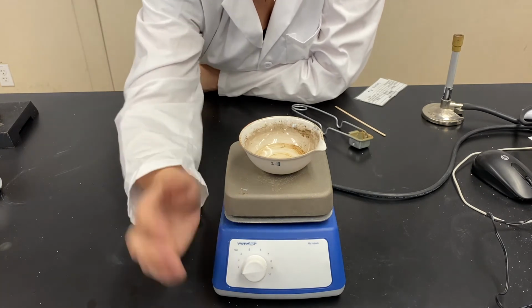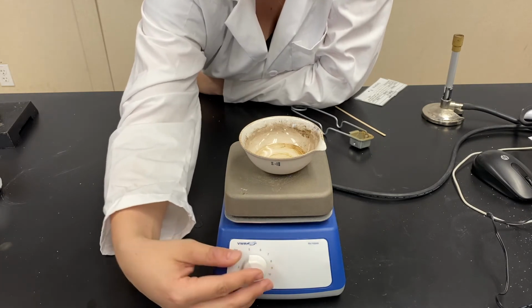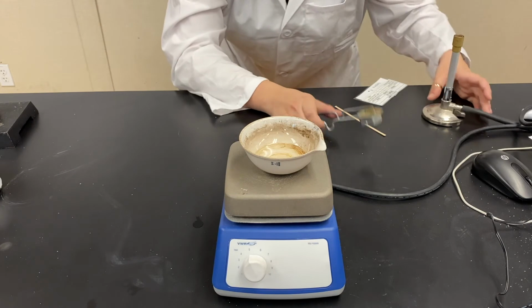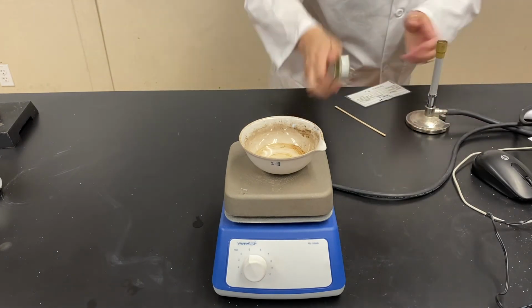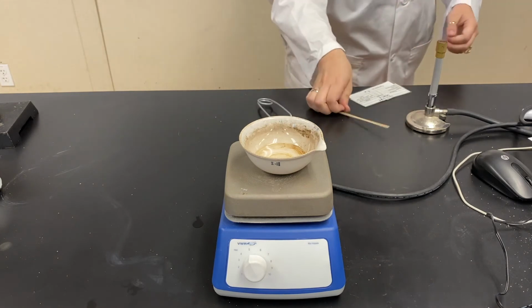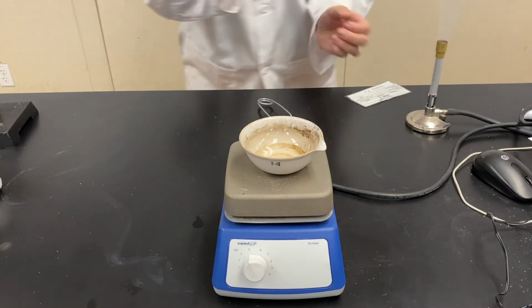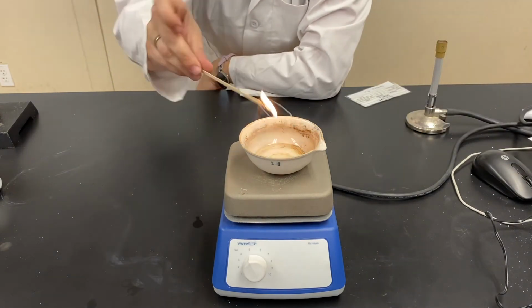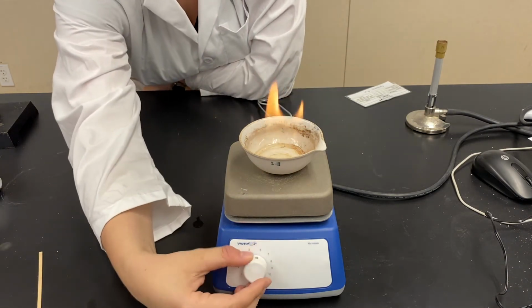Just making sure it's working. Don't touch hot plates. Do as I say, not as I do, right? Here we go. Okay, so it's warming up. And then we light it on fire.